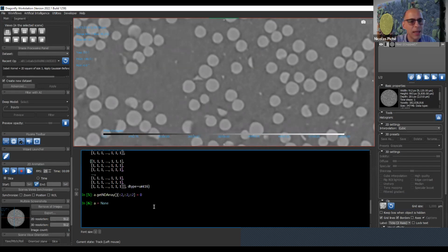But so you can do, and in the Scratch, you can write Python also. So you could have a piece of Python that calls SciPy to do your stuff, load all the batch, all the directory in your hard drive, and do a segmentation with a neural network, output it as a segmentation, dump it in a file. This is all possible. Of course, we have multiple examples, and also we have an extensive documentation on the object model and all that on the website.